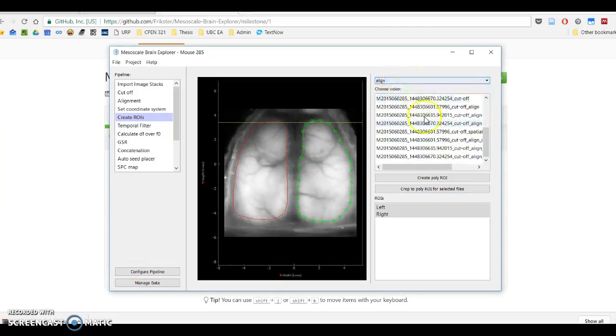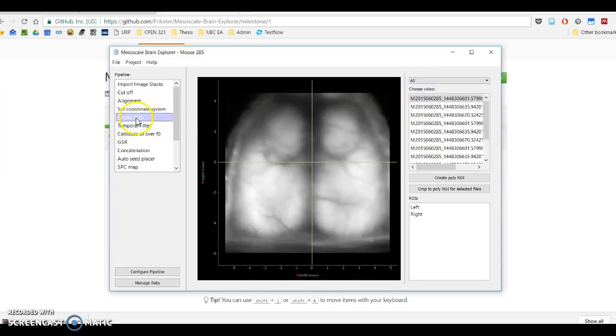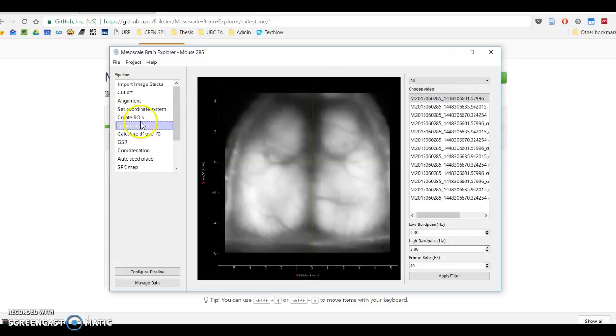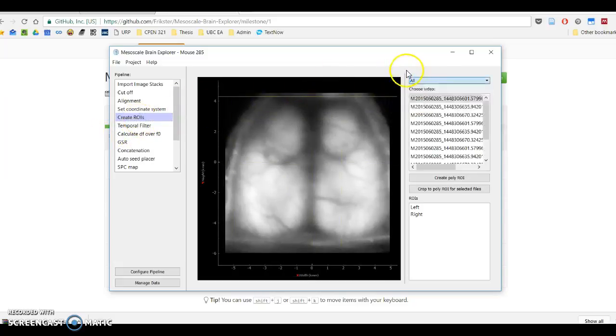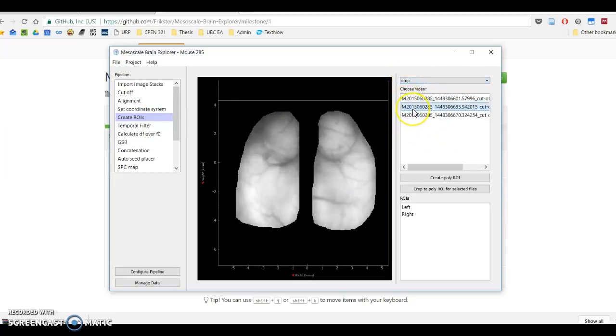We can see, okay, so the filter doesn't actually update immediately. So if we go, for instance, to the next plugin, we'll see over there crop as an option. So yeah, I just went from one plugin back to this to update this. You can see that's a bug that I'll fix later. So filter this to crop, and here we can see all of our crop data. See that it's not perfectly aligned at all. This is okay for our purposes.